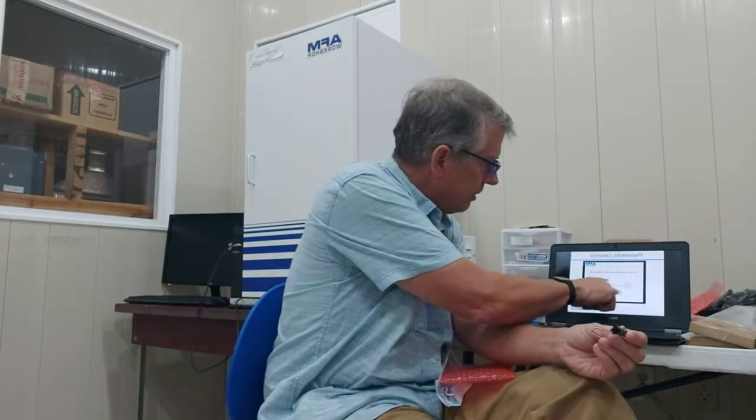You guys saw one yesterday, and we have a ceramic. There's a ceramic in one of these bags here. These right here. You can see that this is the ceramic, and that's the end cap. You see the end caps here. They're black, broke off.